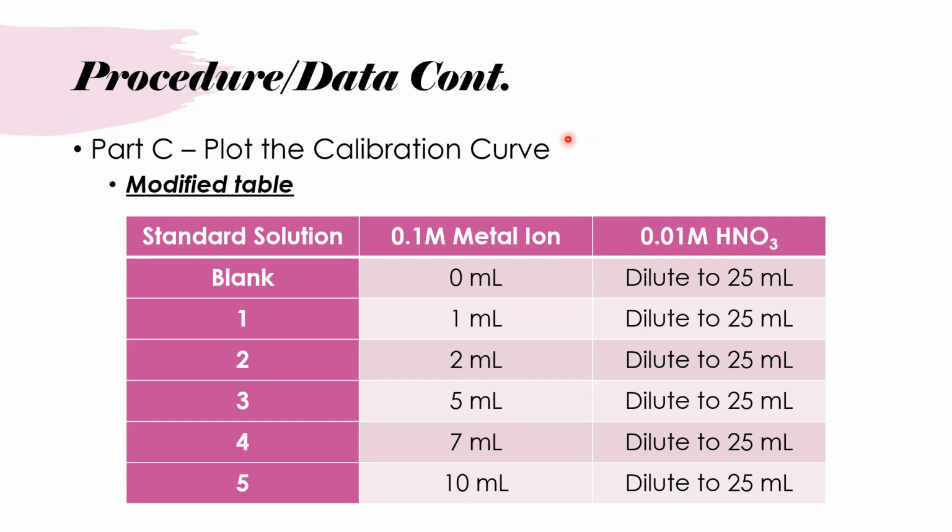We got one more in the chat. In the data we received, it said we needed to explain why we chose a certain wavelength, as in why you chose the maximum wavelength. I'm going to be grading you just on the report sheets, so I think so. It wasn't too clear. Just tell them the values. I don't think there's even a section for that. I'm telling you to skip part B entirely, so just ignore that. You don't have to worry about that.